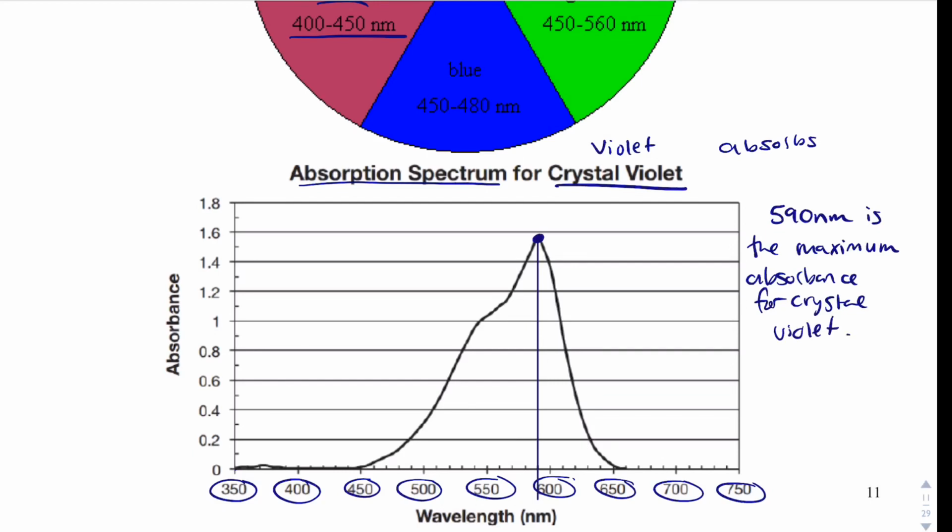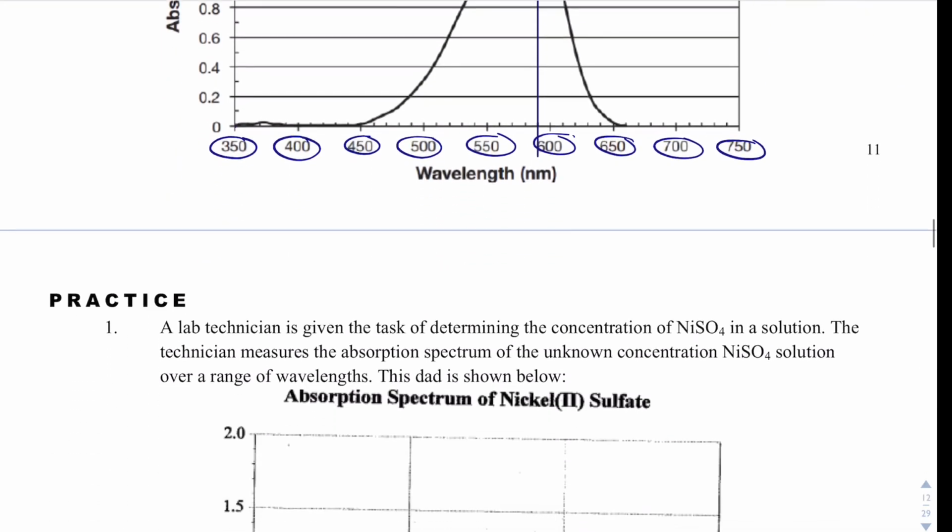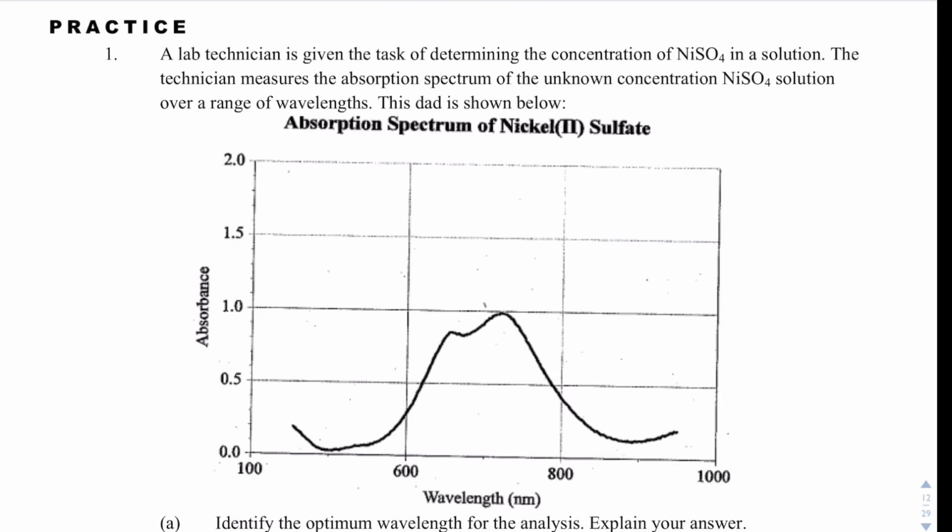Okay, chances are if you set the machine to 550, it would do okay, but it's going to have its best results when you're at its highest or its maximum absorbance. Okay, so let's do some practice questions and we'll call it quits with this video.